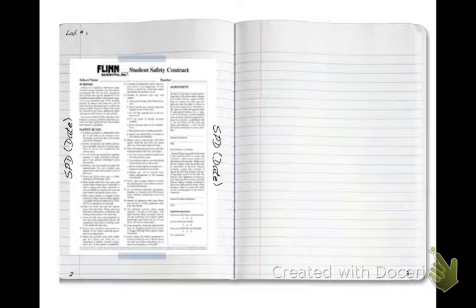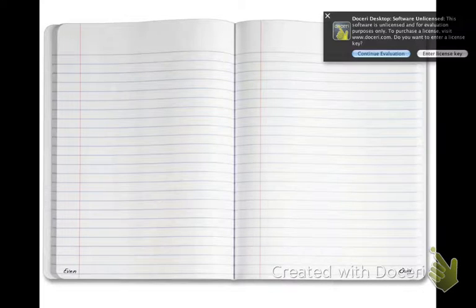Page 3 would start your new entry. So that would probably be lab equipment and whatever we did with that, or physical and chemical changes, whatever that next lab would end up being. So essentially, halfway through your notebook, you will make sure that you have your even and odd numbers paged. The even number should be on the left-hand side, and the odd number should be on the right-hand side. So again, you continue numbering front and back for each one of these.